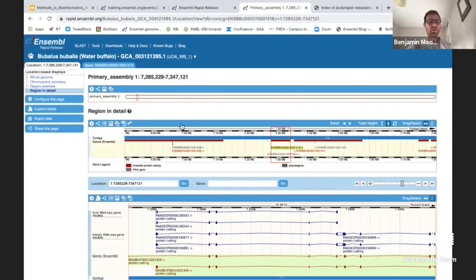In the second image underneath, you can see that this is a 1 megabase overview. The scale is at the top here, 1 megabase. And we have this red box again, which is our region of interest. You can see that the data is now arranged into what we call tracks. We have the contigs track and the genes track in this case.